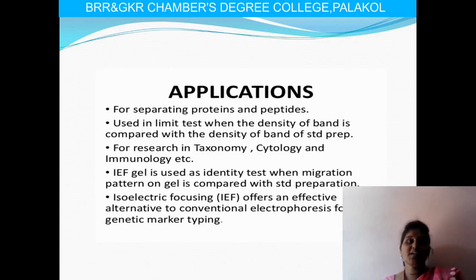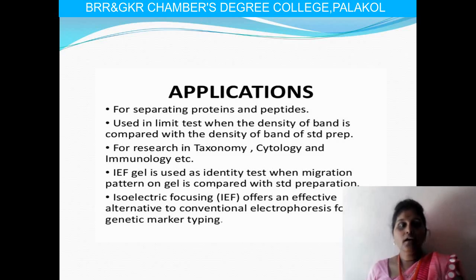Then applications. As I already said, it is used for the separation of proteins and also peptides, and we can use it for types of proteins like serum proteins, globular proteins and also fibrous proteins. It is used in the research of taxonomy and cytology. It is a highly sensitive electrophoretic technique. Here it is particularly useful to study the microheterogeneity in proteins, and it is particularly useful for the separation of enzymes which are different forms of the same enzyme.